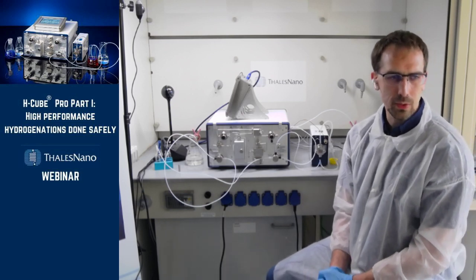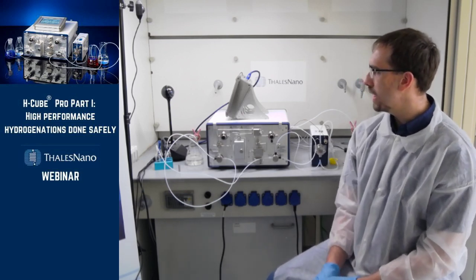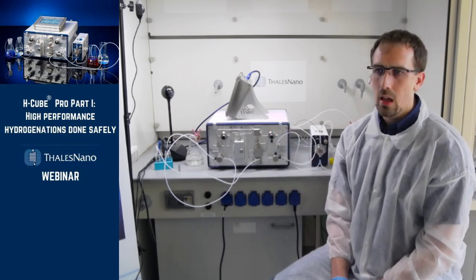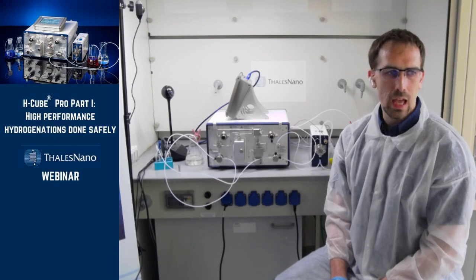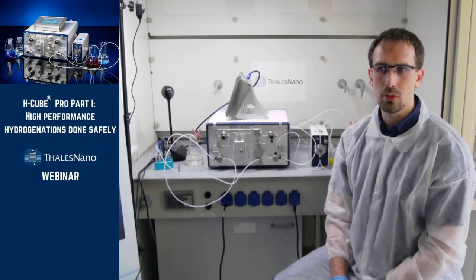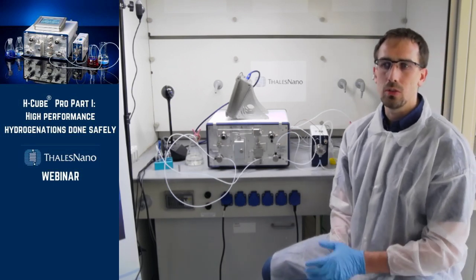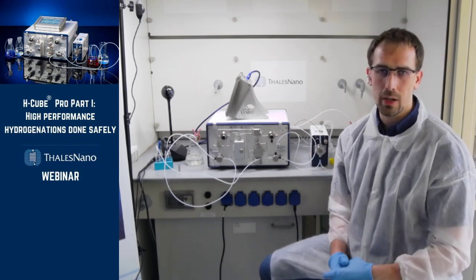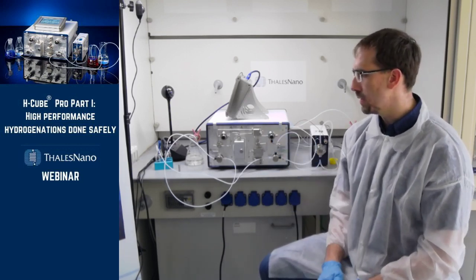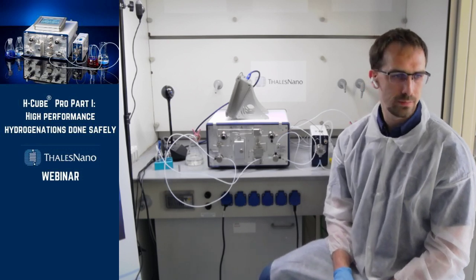What are the outputs for data transfer? You can either use a USB stick to transfer data, and we also have solutions to use the instrument with a third party application, so you can communicate with the instrument using TCP/IP protocol.